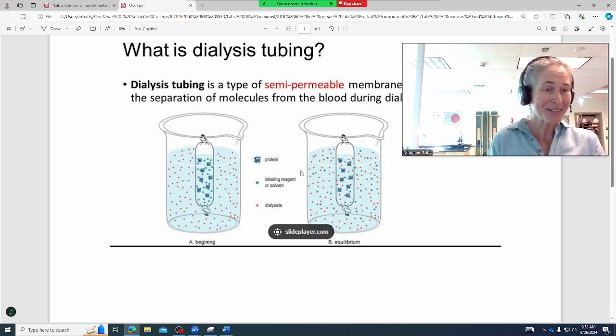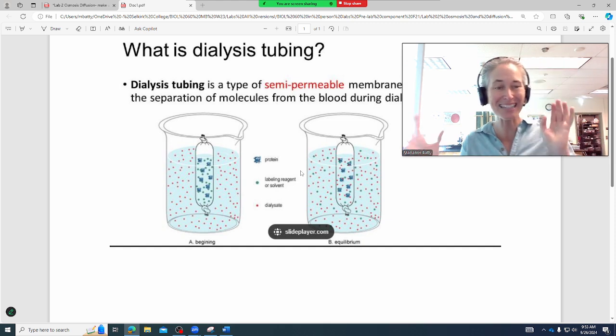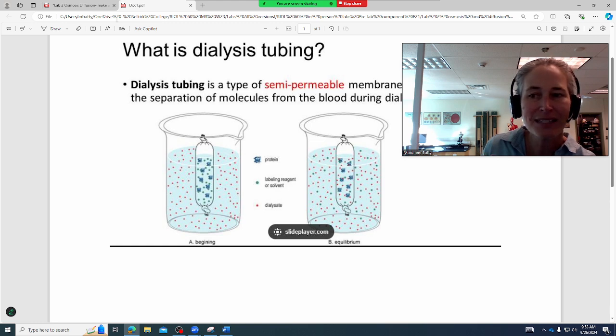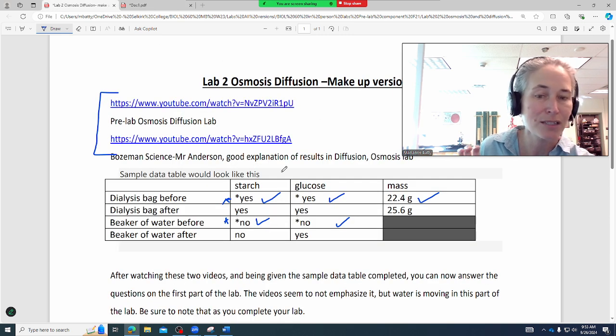You'll be able to fast forward because you don't have to wait. I'm going to show you how it goes anyway. So imagine half hour has passed. After, when things have reached equilibrium, this diagram over here is illustrating that. And so this could be a handy one if you freeze frame. You can kind of see the dissolved things. If I switch back to my results, I've pre-recorded these for us.